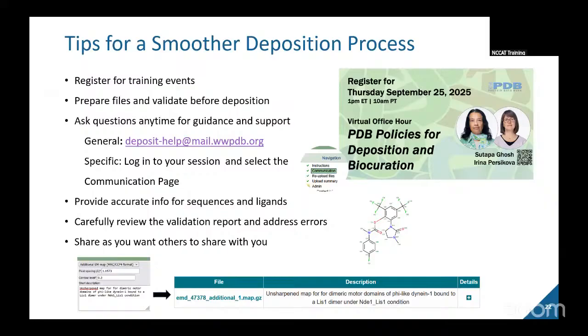Well, after we publish, and then there's something wrong, we obsolete the structure, right? But then can we open it and access the obsolete one? It is accessible, but not at our public website. We keep it in the archive, as part of the record if it was released. When they look at the one that superseded it, yes, when we put in the supersede record, then if they go to RCSB looking at the paper and type the code from the paper, it will automatically redirect them to the improved structure.